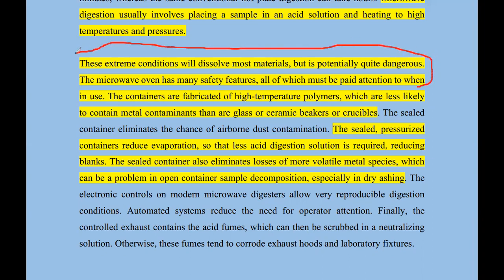So as you use these microwave acid digestions, and even as you design as implementers, it is important to take the fumes into consideration. For as long as there's a liquid boiling, you expect vapor coming out of it. So how do you manage that? It is always important to do that.